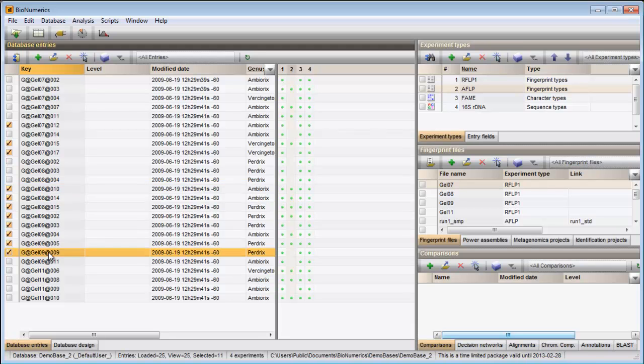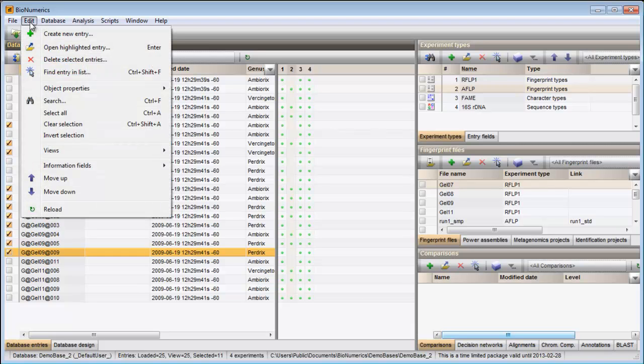To invert the current selection, select Edit Invert Selection.